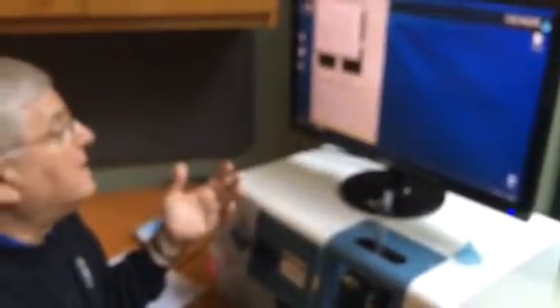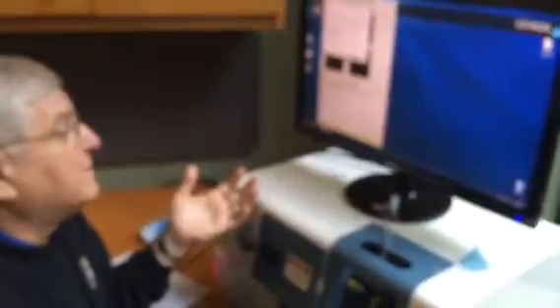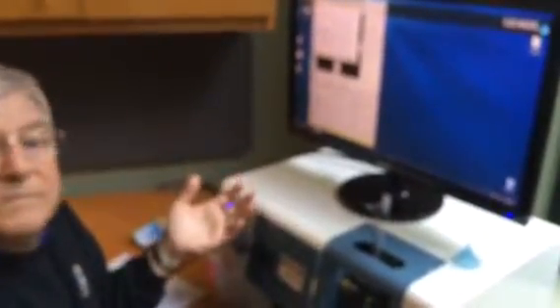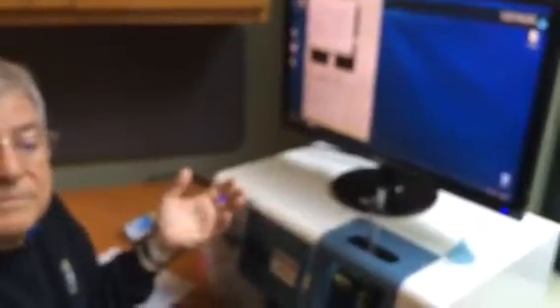So now we have to think about this: distance to the nearest neighbor. We basically set this up before, but that looks like a different one than we set up. It is a different one. It might have been the default for this instrument, because it's been through multiple applications. That's why I teach you application specific.